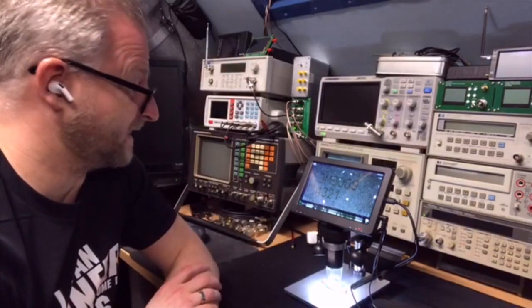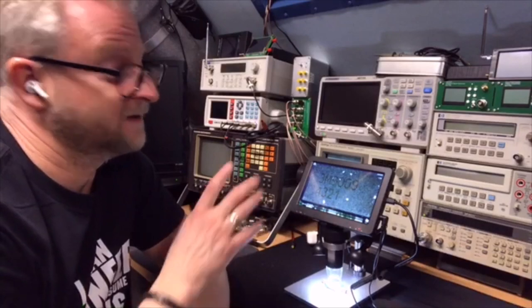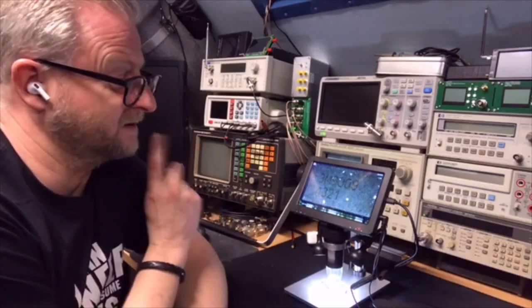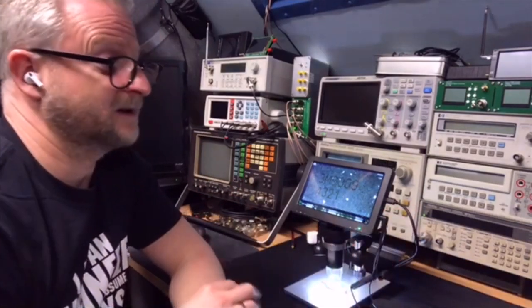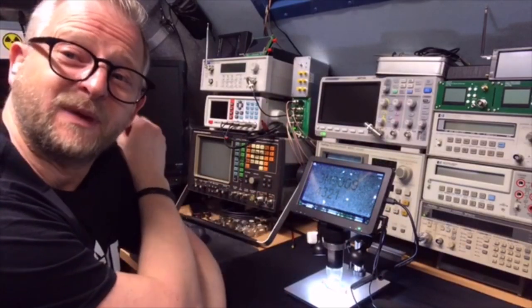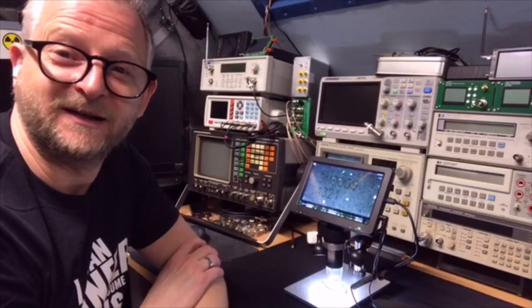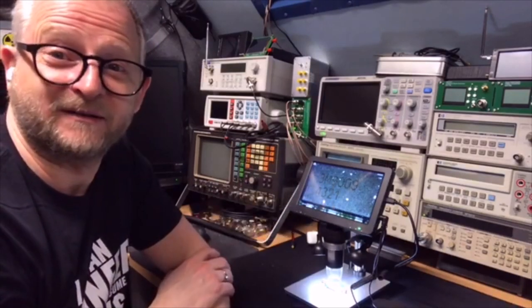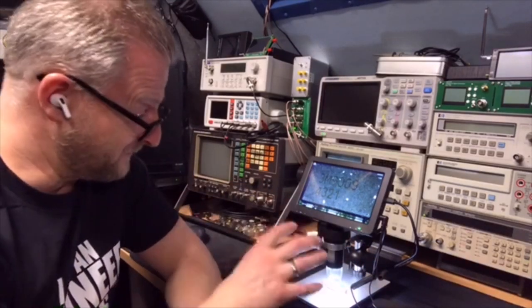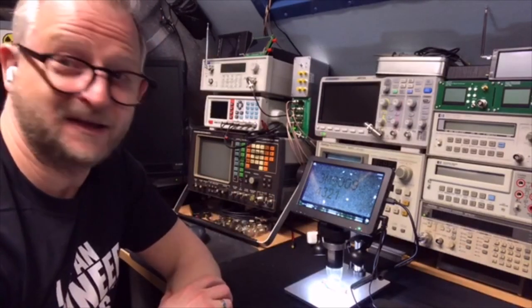But what I've seen now, I didn't sound too enthusiastic, maybe, but I am, because it looks really, really good. Only the live view on the computer is really low resolution. I'm disappointed about that, but I don't think I need to be, because we put the SD card in, and then we can make pictures of 12 megapixel. And in the end, the live view was not that bad. It depends what you want to see, and it really magnifies amazingly, and the screen is big enough, because you can even see here from the camera you are looking at it. It's cool. And in the end, it was not that expensive at all. So I would almost say it's proper quality.